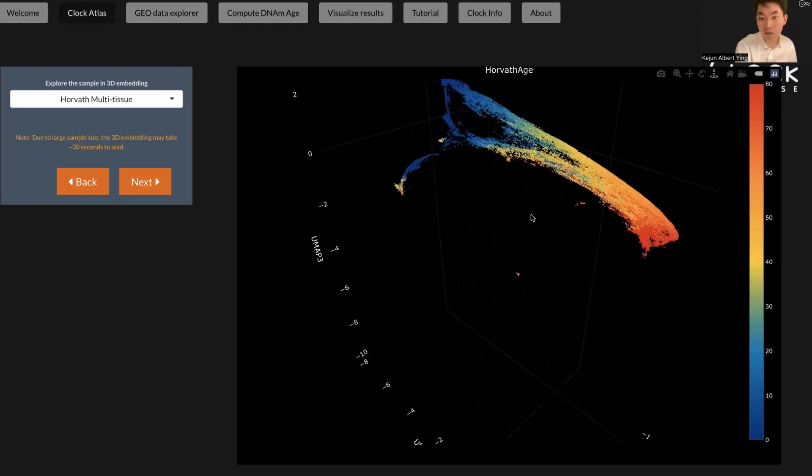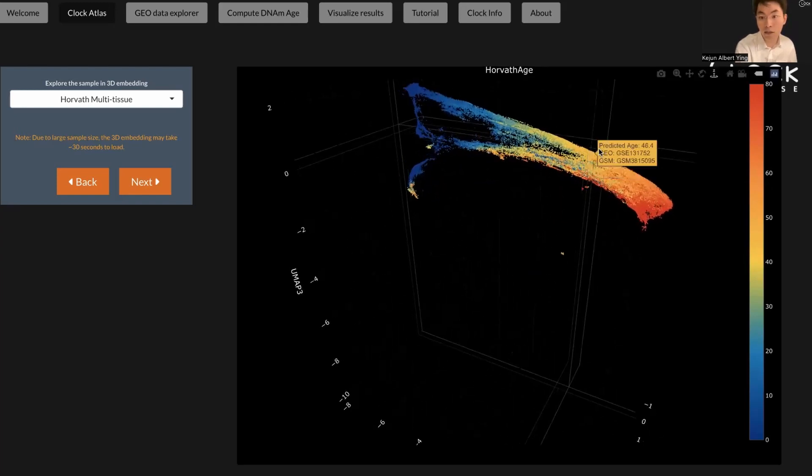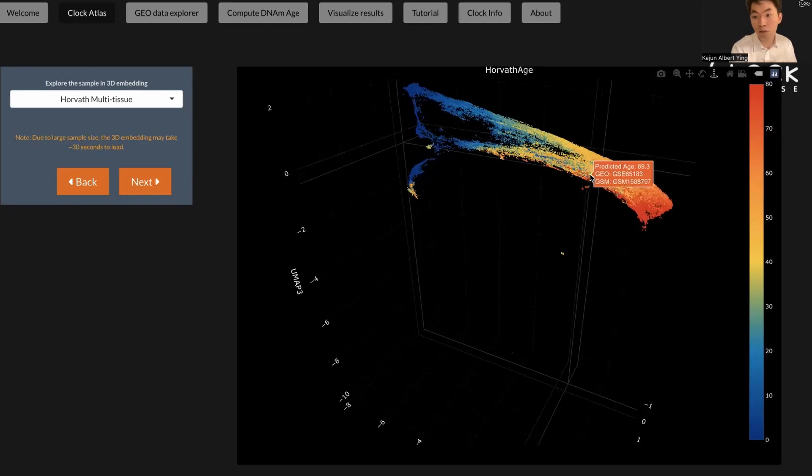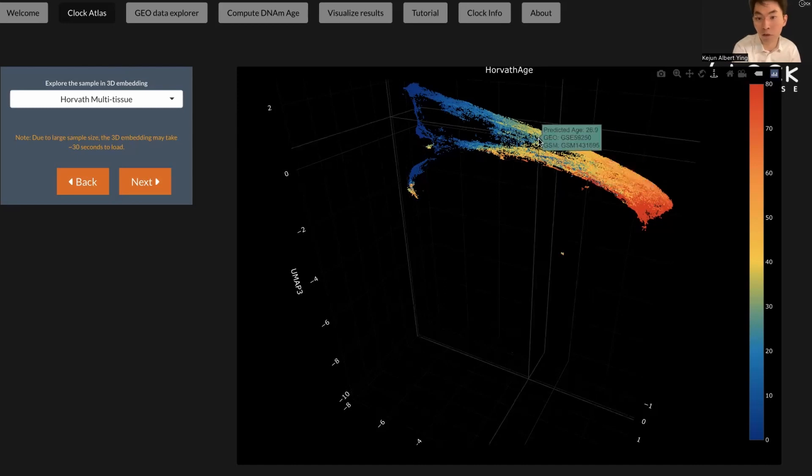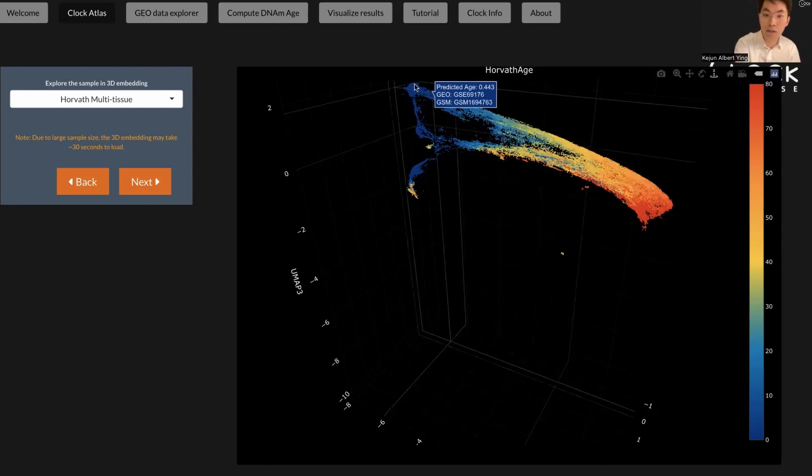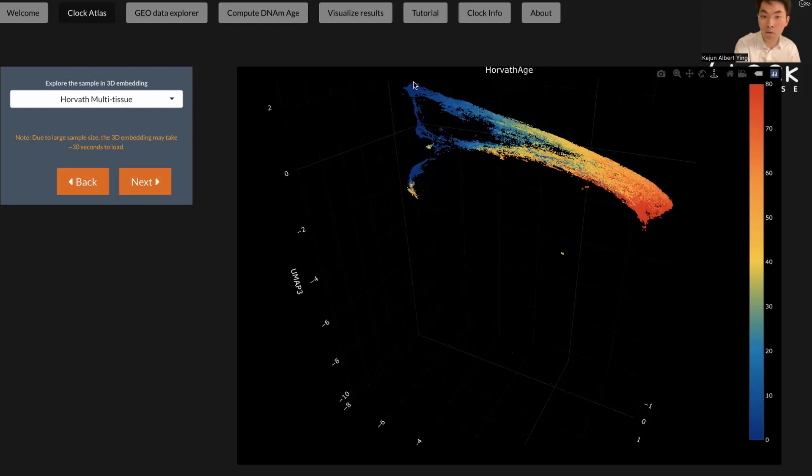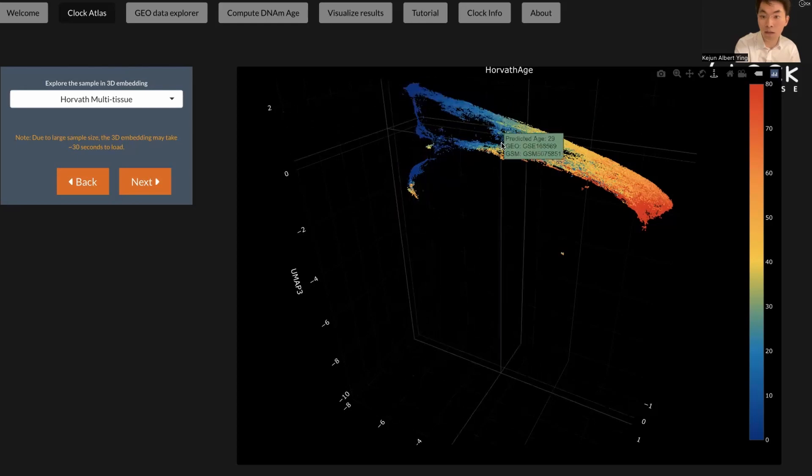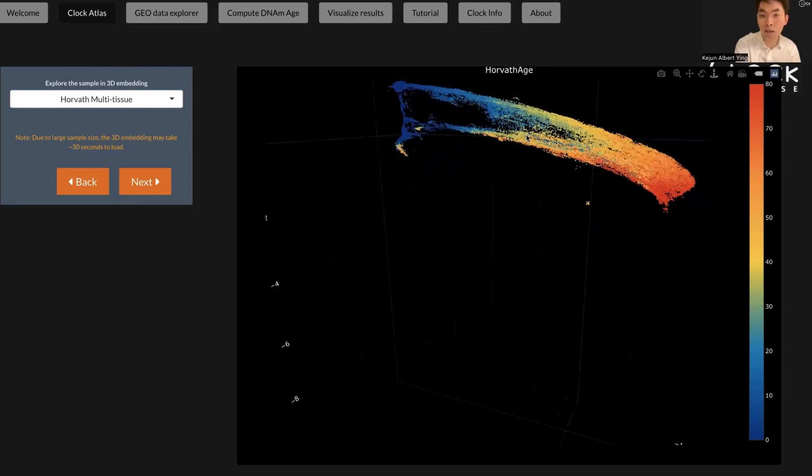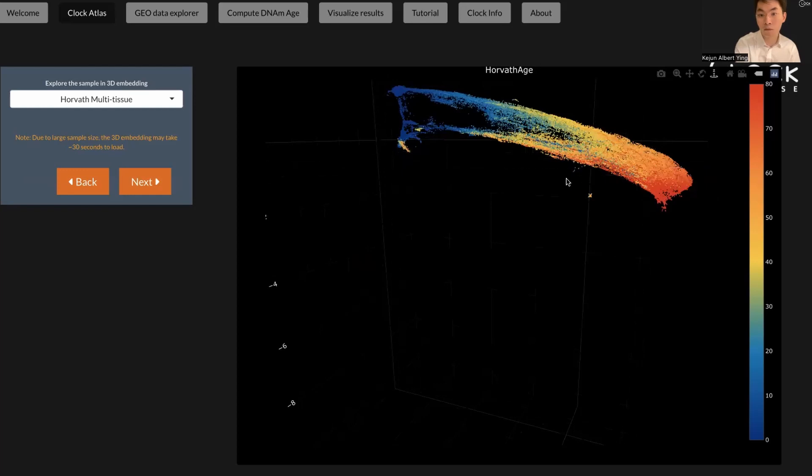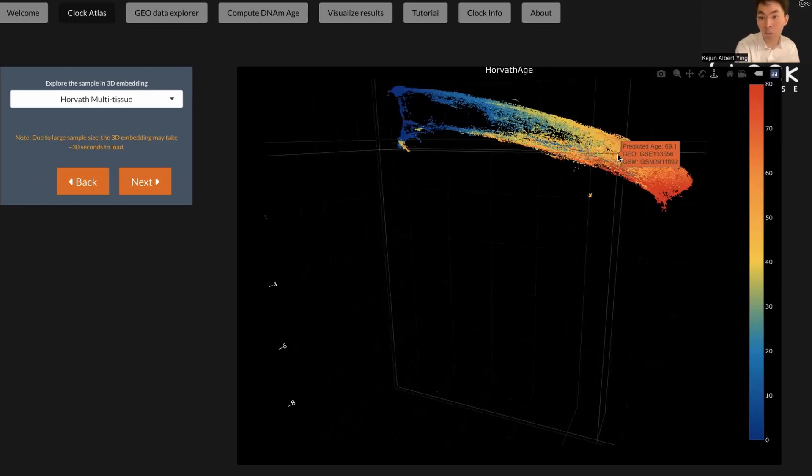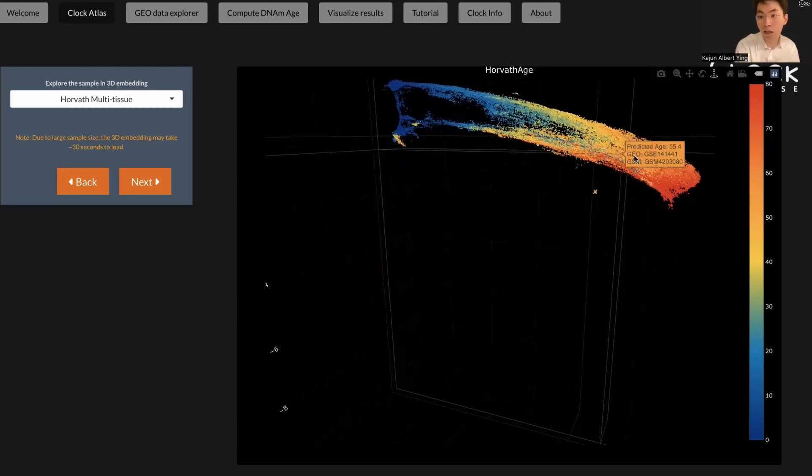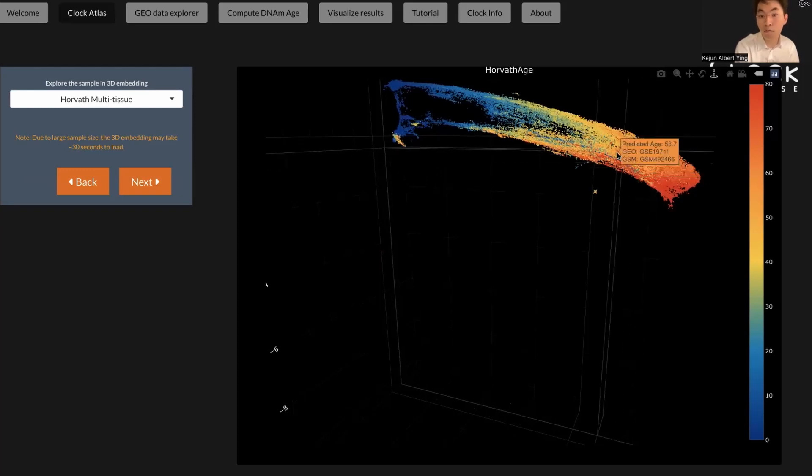Similarly, in this sample, this shows the estimation from, in this example, Horvath's age. Here you can see the young samples are mostly on the left side of this plot, and the old samples are located on the right side. So you can see a very nice trajectory, and you can also see the predicted age and what GEO dataset this sample comes from.